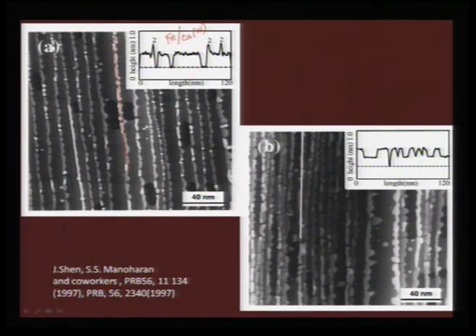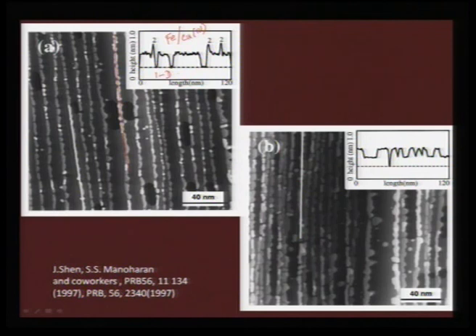Therefore, for those who are interested in the magnetism of these iron films, it becomes a very, very important information, because you are almost successfully making one-dimensional iron stripes. So in this you can see what is the nature of magnetism there. But from STM point of view, I do not want to discuss the magnetic information, but you see here is a line that can be drawn on this topography, which is a post analysis. You do not usually do this when you are scanning the STM.